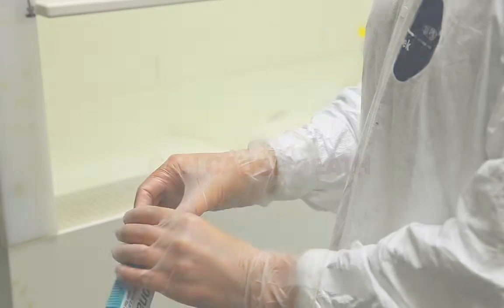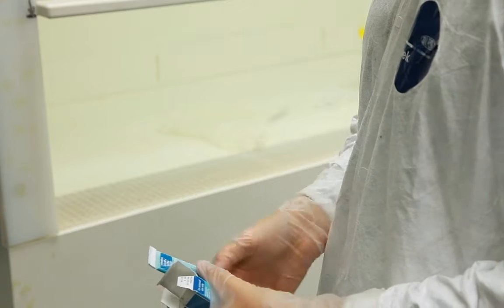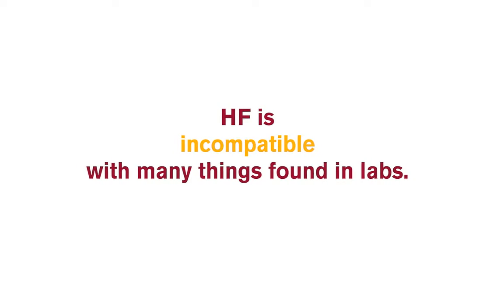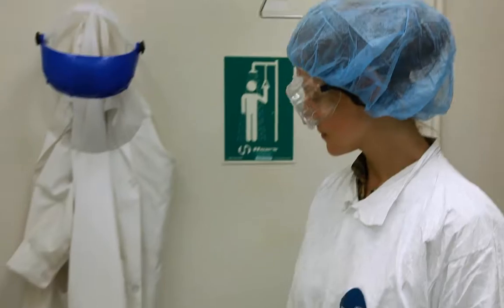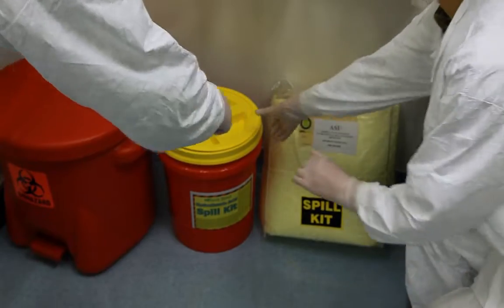Therefore, exposure prevention is key and if exposed, immediate medical treatment is critical to avoid severe health effects. HF is incompatible with many things commonly found in labs. HF attacks silica-laden materials such as glass, clay, pottery, and concrete. For the same reason, the yellow laboratory spill kits cannot be used for HF spill control.